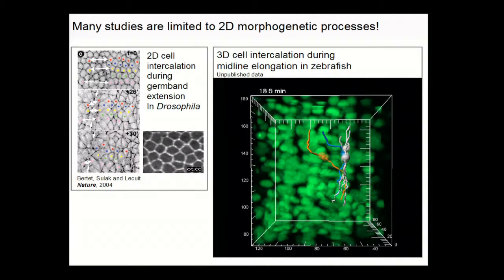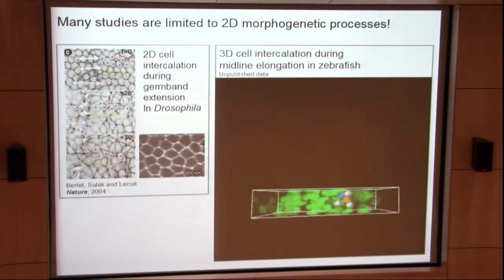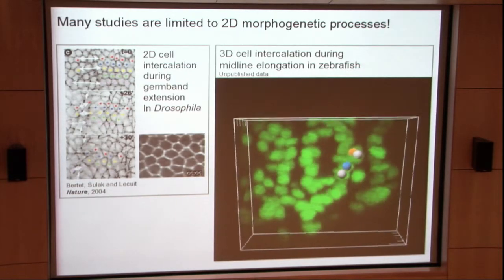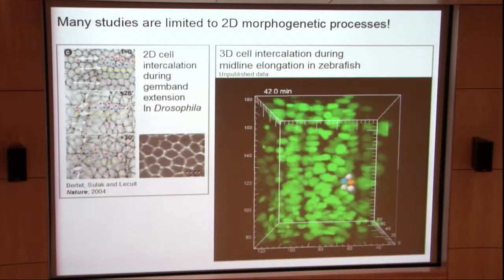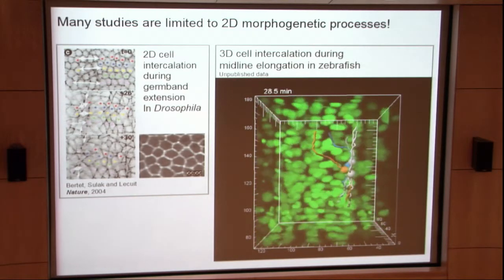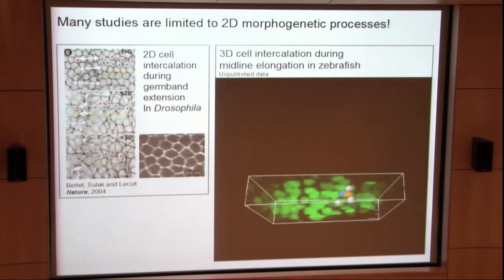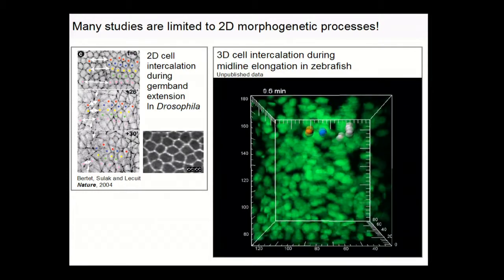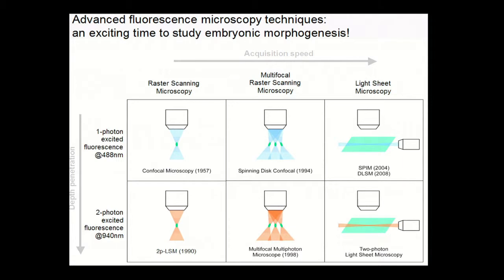So I think it's the case for more than 90% of the projects different biologists are working on. At some point the challenges are so high that they just give up and try another strategy. So that's why I think the challenges and needs for visualization tools in developmental biology are really hard to see in the literature, because most of the challenges are behind the scenes. So today I will try to focus on a few things that you cannot see in the papers, in the final work.